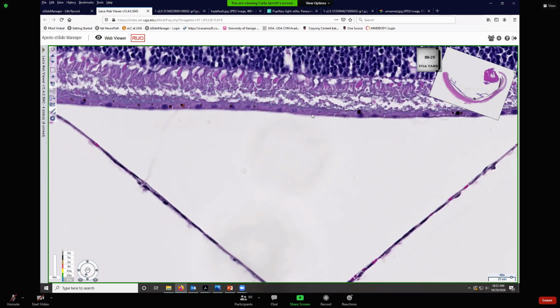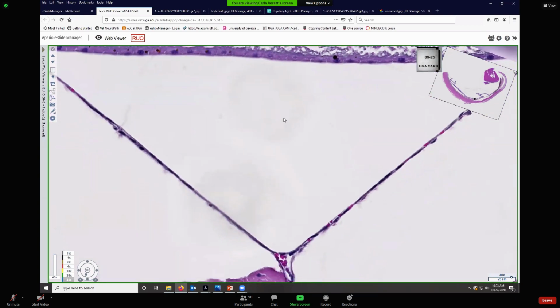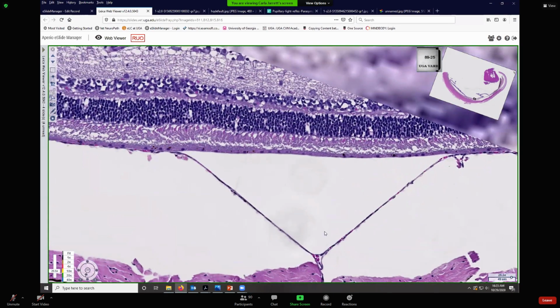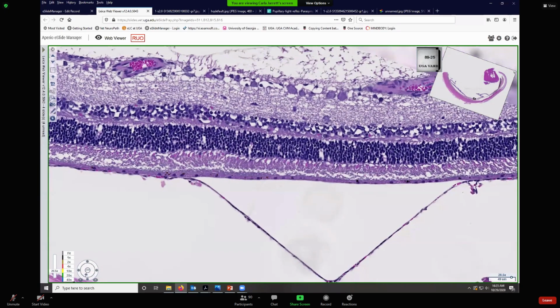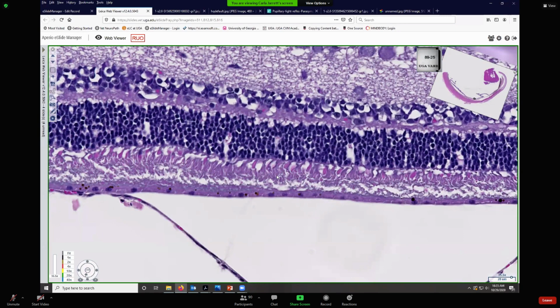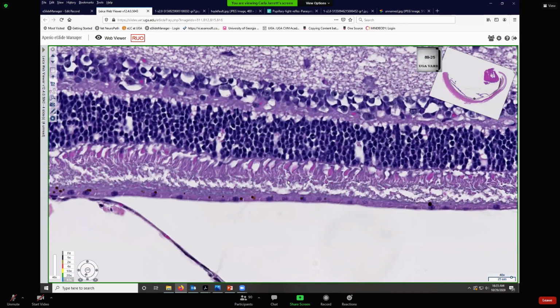That is because the retinal pigment epithelium got rid of its pigment where it overlies the tapetum. So once again, a photon of light traveling this way will come down through all the layers of the retina, and it will try to excite this outer segment of the photoreceptor cells.